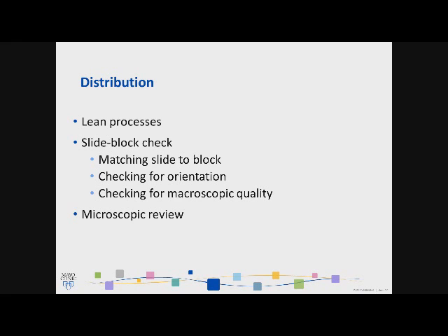We also perform a microscopic review of approximately 15 to 20% of our cases. This is performed by managers, supervisors, and leads of the department. Periodically throughout the morning, the cases are pulled and taken over to the microscope. With education, we know what each tissue type should look like, what the cellular elements should look like, and we verify on what we call our blue sheets, lovingly.